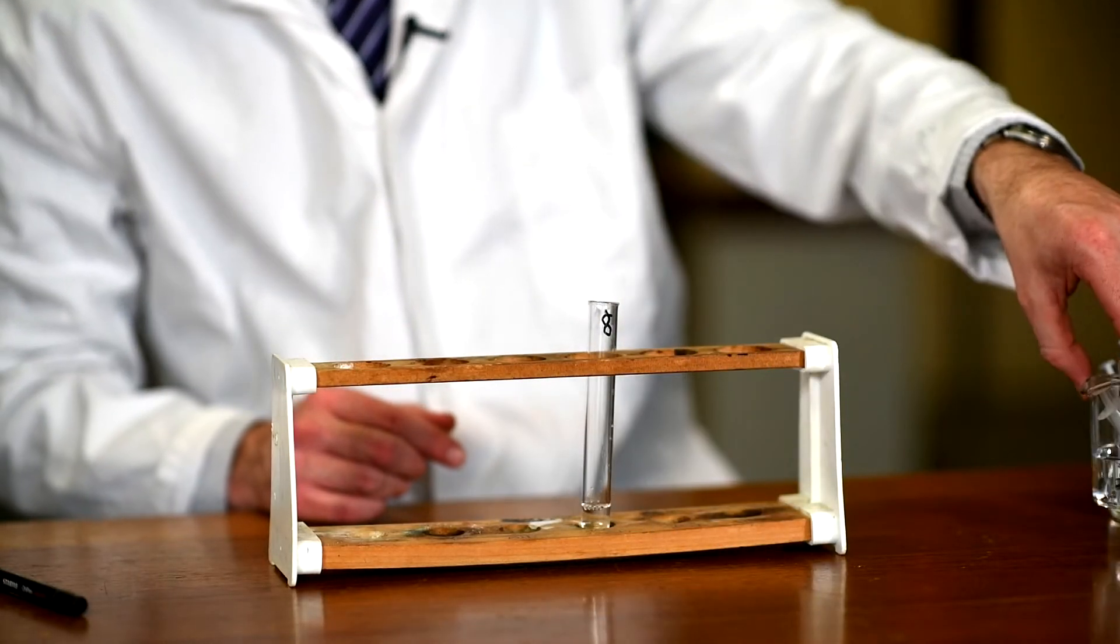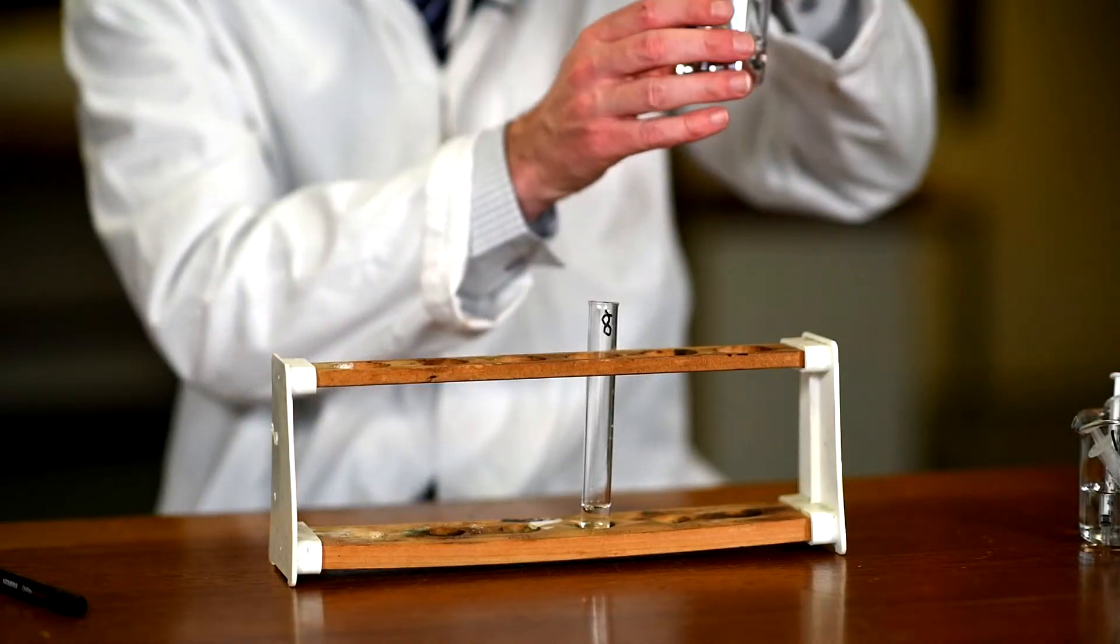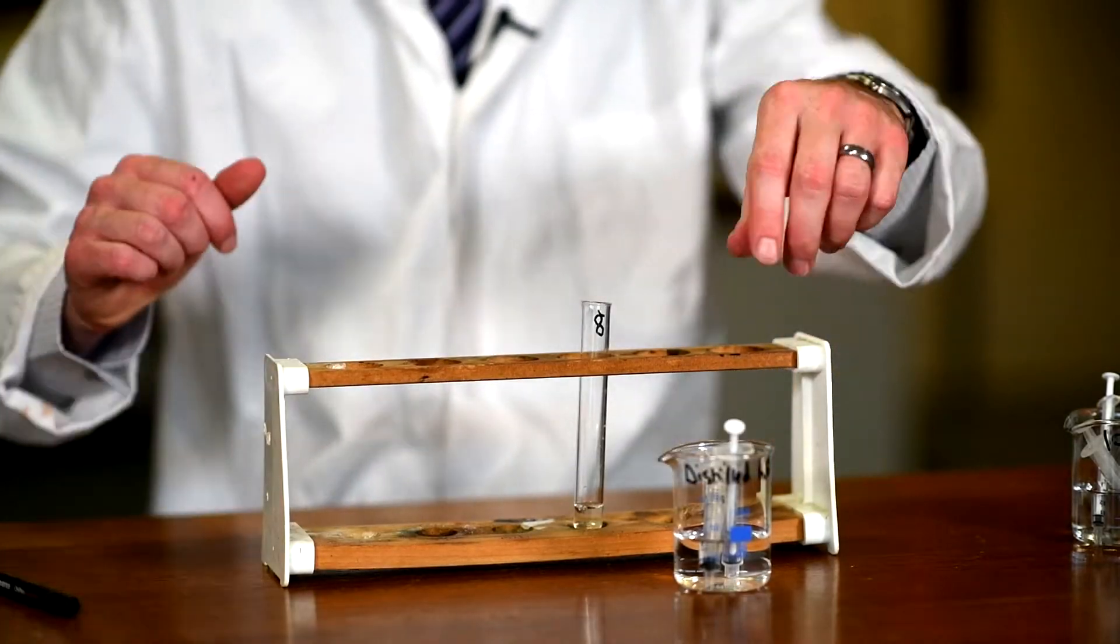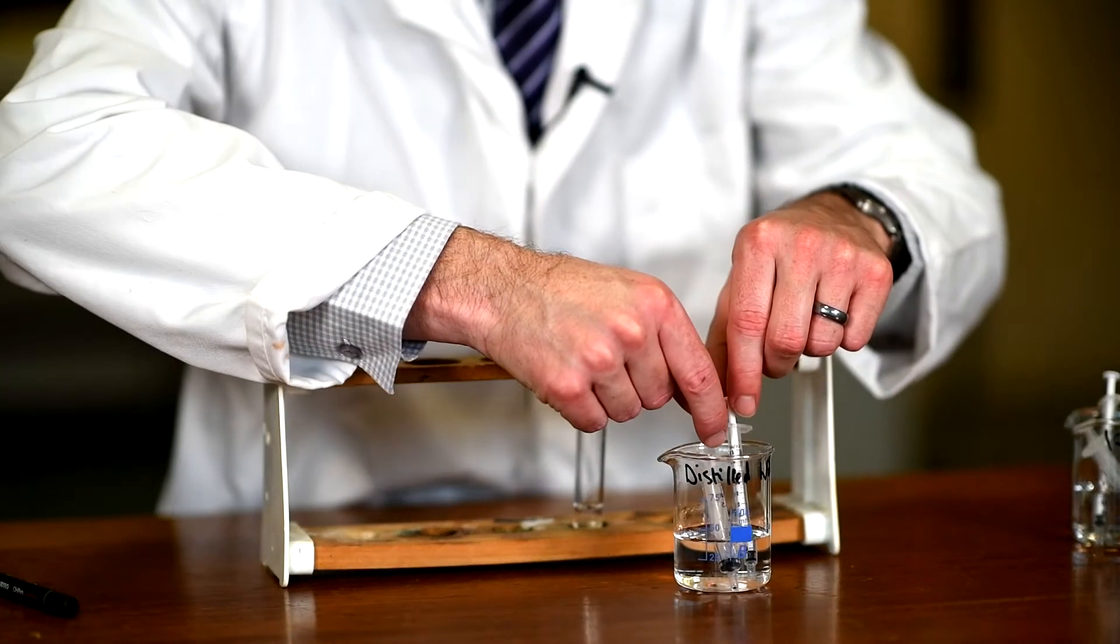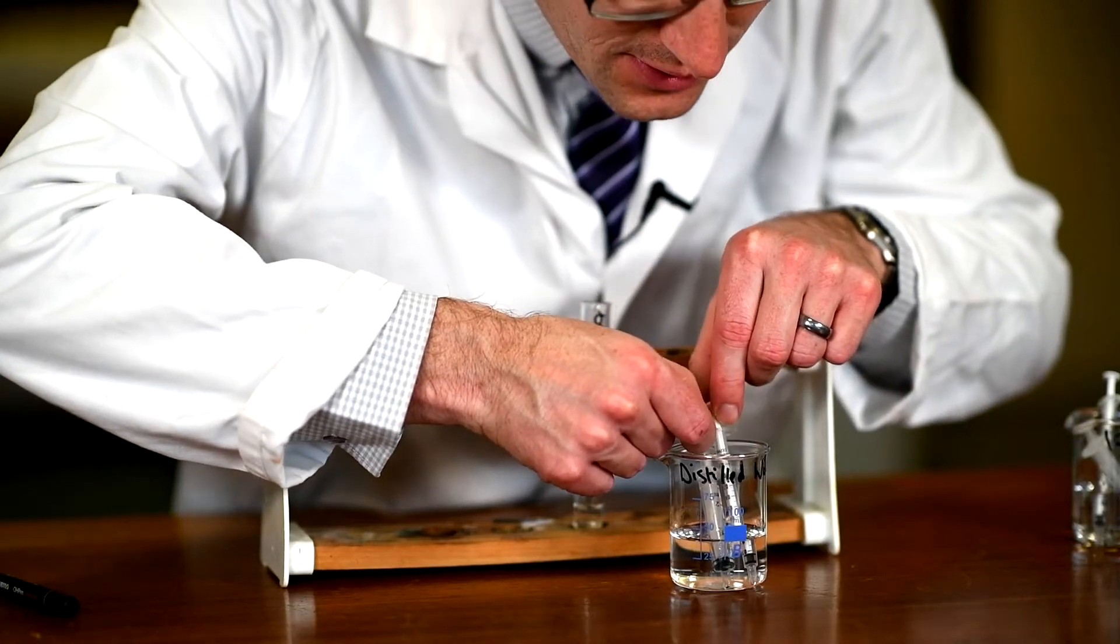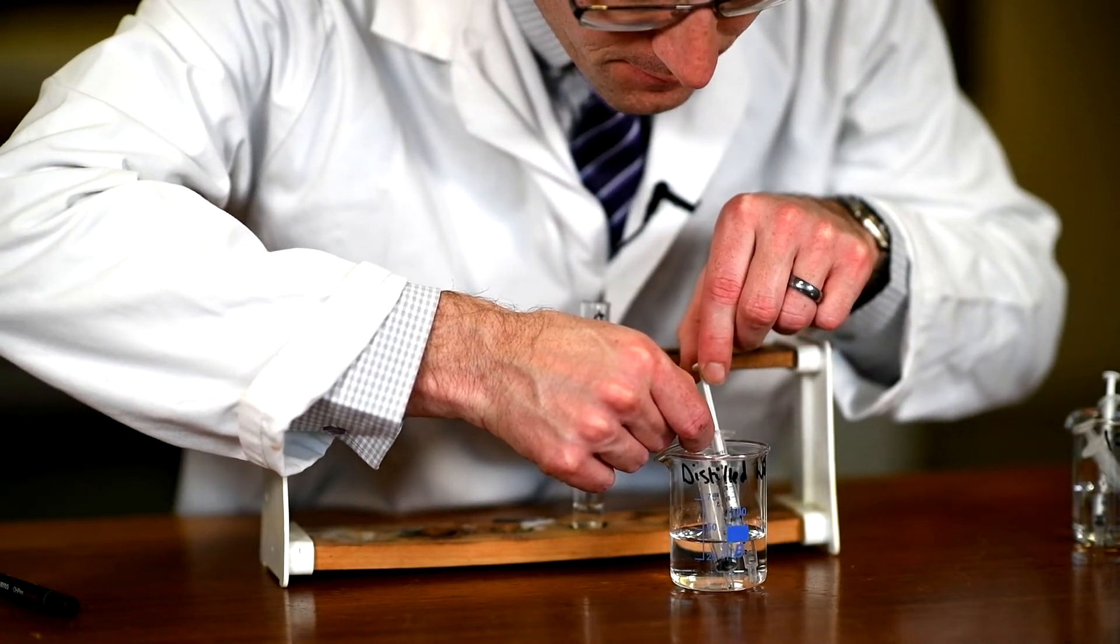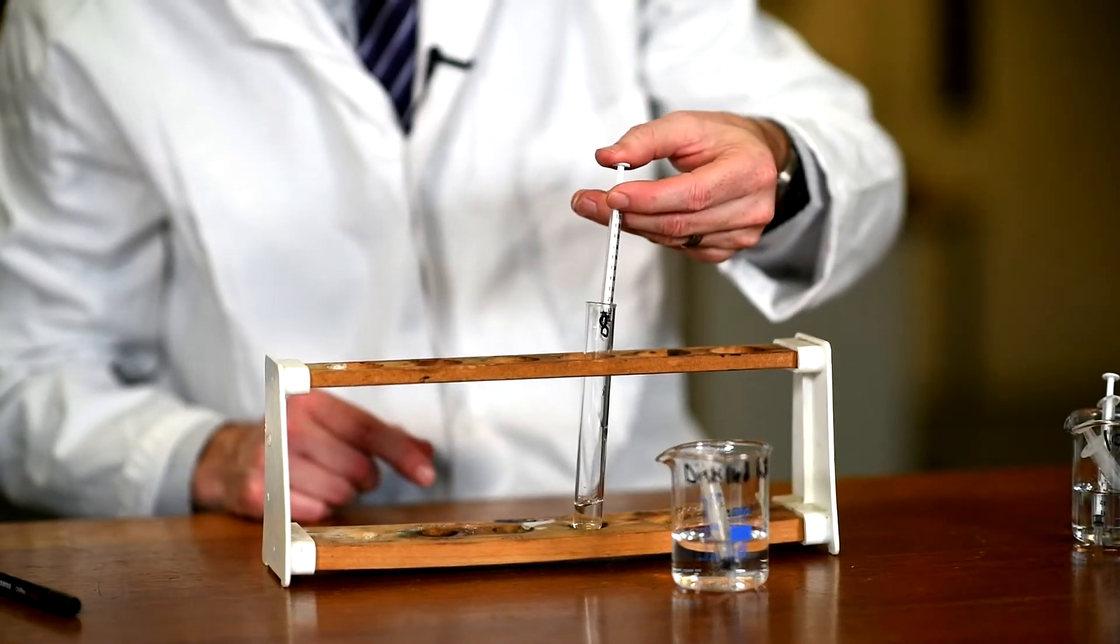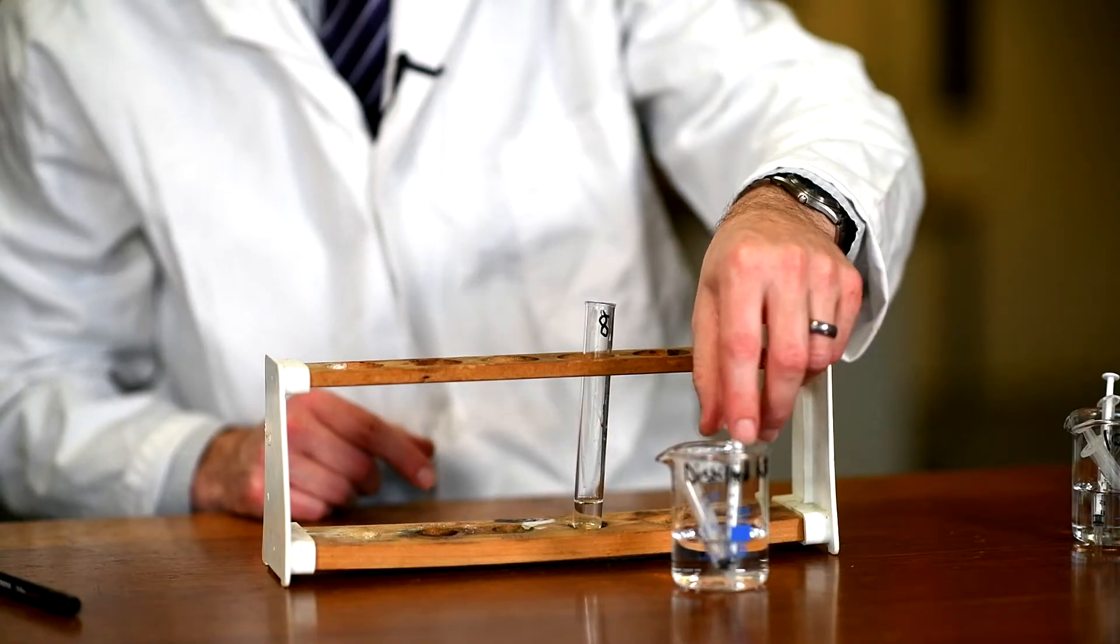We now need to dilute the glucose with some distilled water. So I have a beaker of distilled water here. Again, I've got two syringes, a two milliliter syringe and a one milliliter syringe. This time I'm going to use a one milliliter syringe to carefully measure up 0.4 milliliters of distilled water, making a total volume of two milliliters.